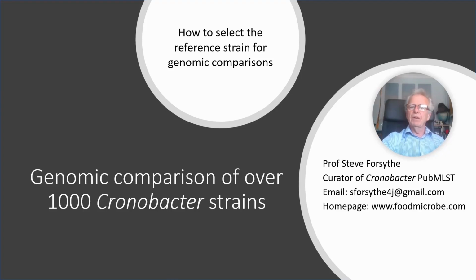Hi everybody, I'm Professor Steve Forsythe, and today I'm going to go through how to change the reference strain in order to do genomic comparisons within the Cronobacter PubMLST database. Now I'm going to go really up the scale. I'm going to do over 1,000 Cronobacter sakazakii strains in the analysis. And you'll hopefully be interested to see how much information you can easily get by doing this sort of genomic comparison.